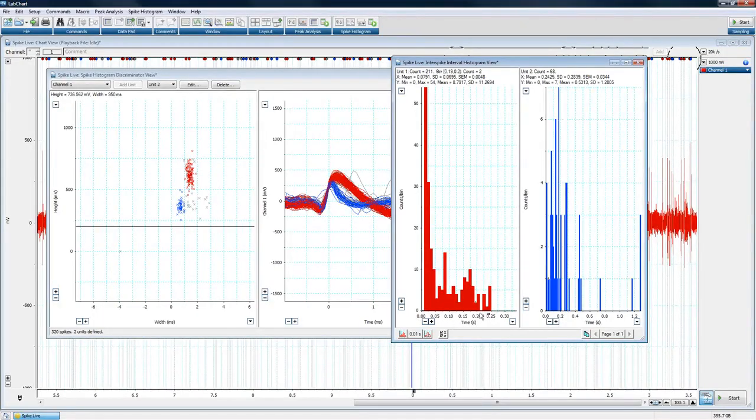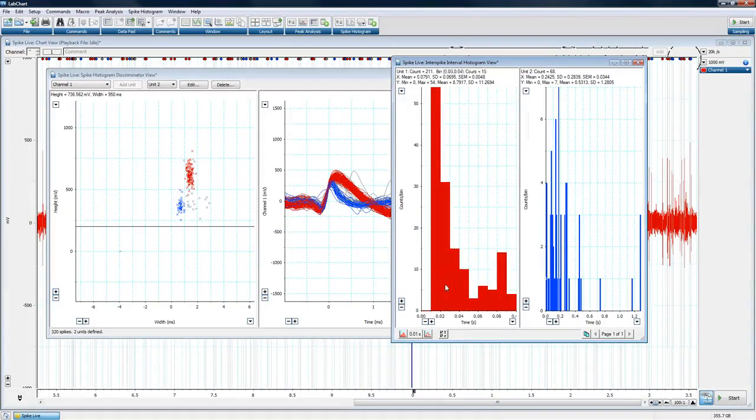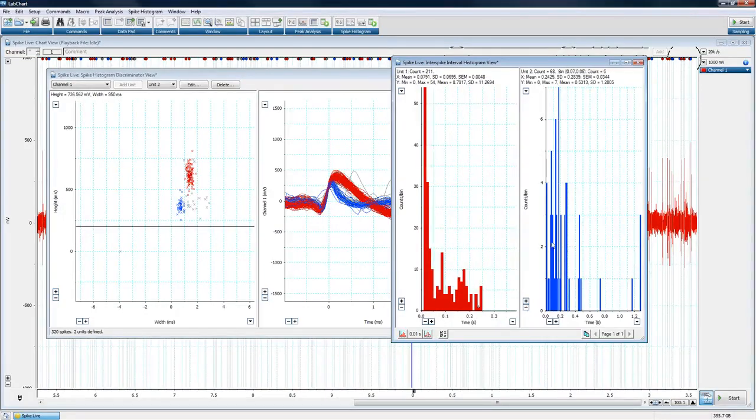And you can see one of the clear things that we start to see out of this data particularly is that very often when unit 1 fires, we don't see unit 1 again for a short period of time, and then we very often see it fire as a doublet. So we see it fire and we see it fire again in a very predictable spacing, and that's what this is telling us. We don't have similar information about unit 2, but what this basically gives us is the ability to analyze the timing of the firing. If unit 1 fires, does it fire again?